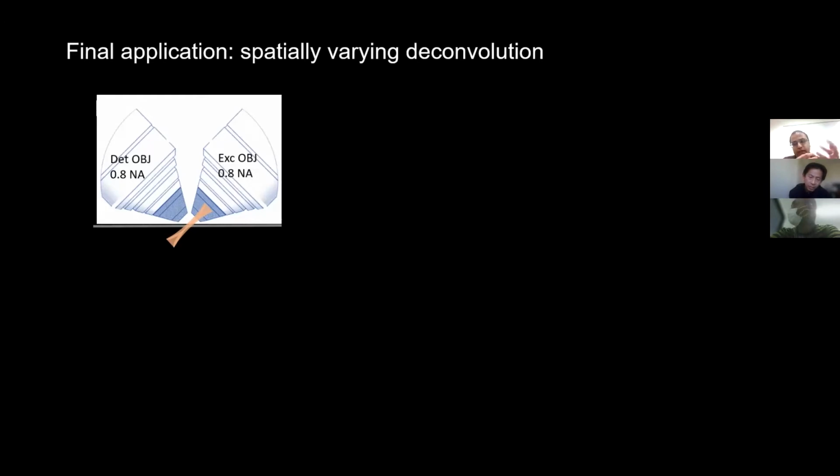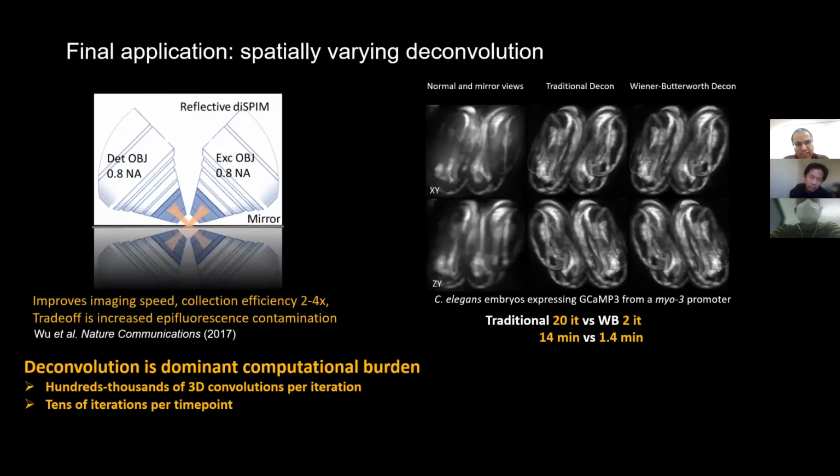And one way of doing that is to, instead of putting your sample on glass cover slips, put them on reflective cover slips, a mirror if you like. And so this mirror has the function of reflecting the light sheet back. So now you have two real light sheets instead of just one. This means you can collect more data per unit of time.